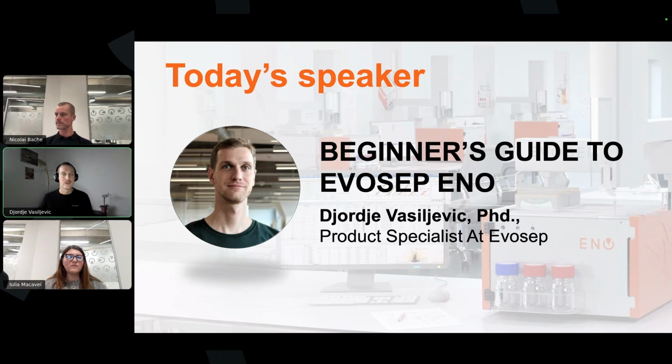So if the system was sitting idle for some hours, when you start your sample queue, even before it starts the sample, it is not going to ask anything, it's just going to kick in an automatic round of degas to make sure that the system is in top condition for the first sample in the queue. And then the degas will be part of the sample run, happening in the background while the sample is running with a high pressure pump. But yeah, I hope I answered the question.